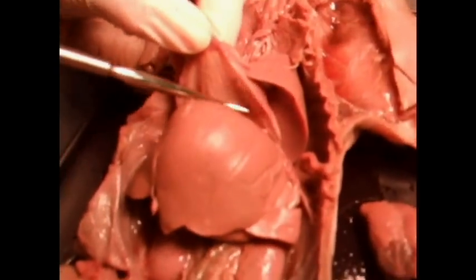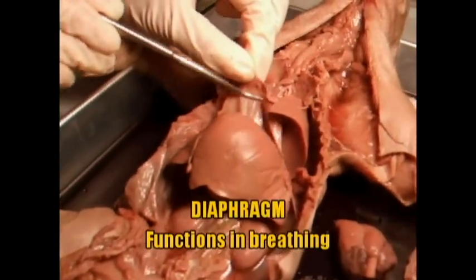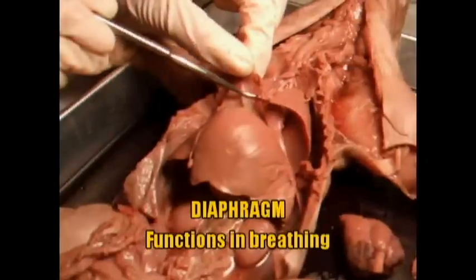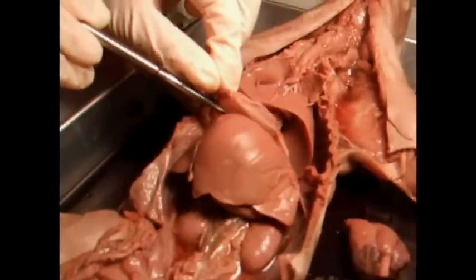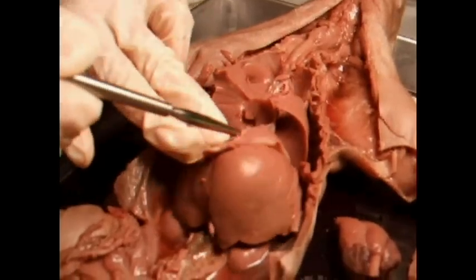Now that the heart's removed, you'll notice down here it's a very thin layer of muscle. This is what we call the diaphragm. This is what moves your lungs up and down in order to take in air and expel air. So this is your diaphragm, right over the liver, right underneath the heart, which we took out.